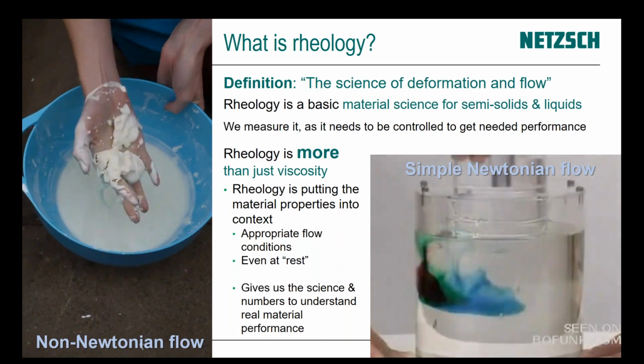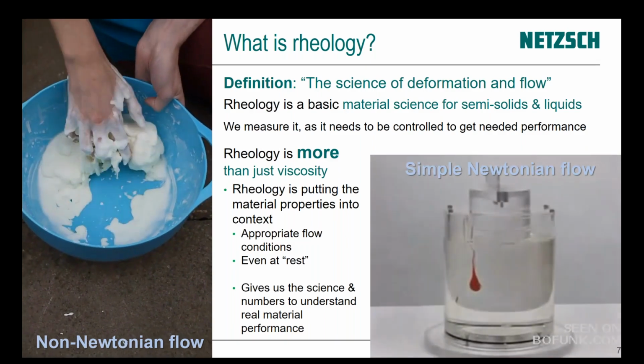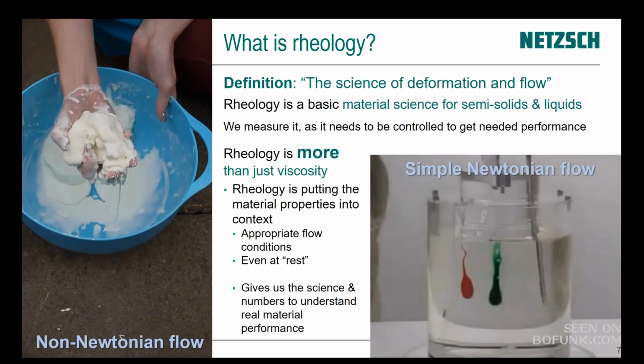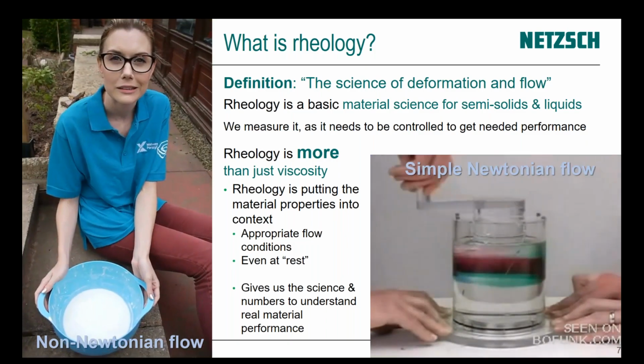What that means is it is a material science. It's a material property that we will measure. But what's going to be important for this session today is putting it into context. We need to simulate the conditions the material will see. But we'll also talk about how it's more than just viscosity.